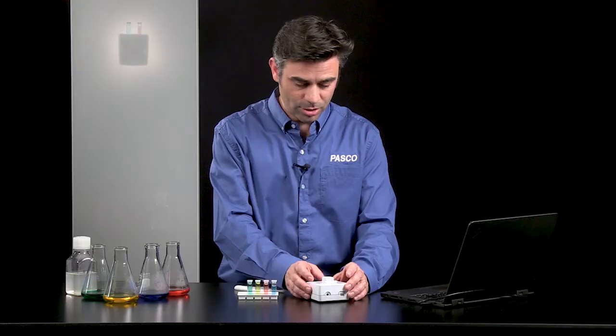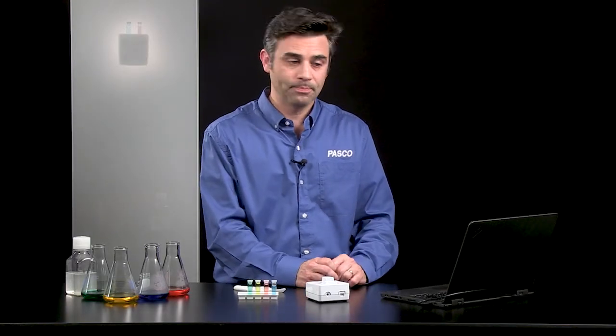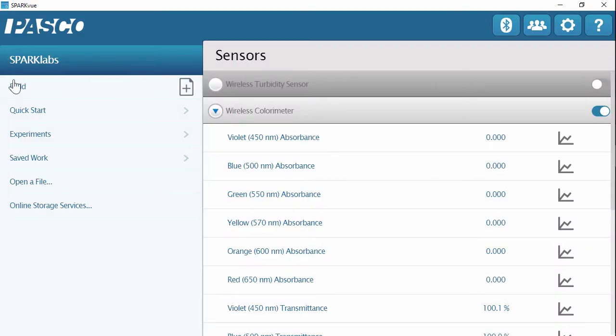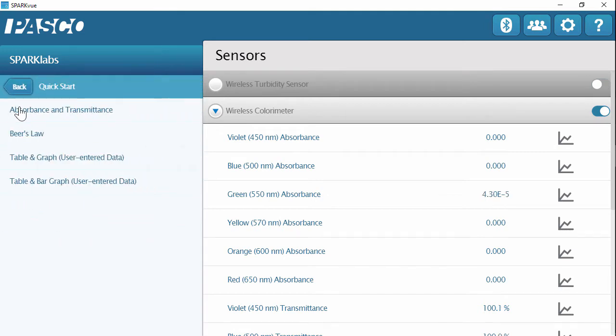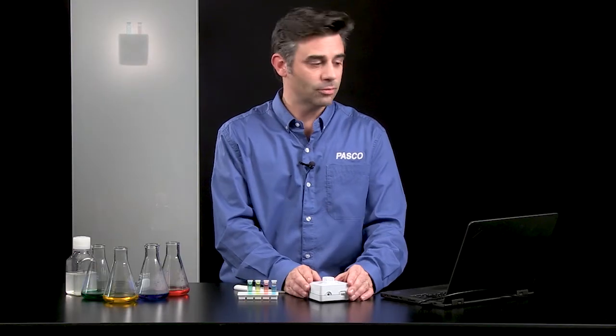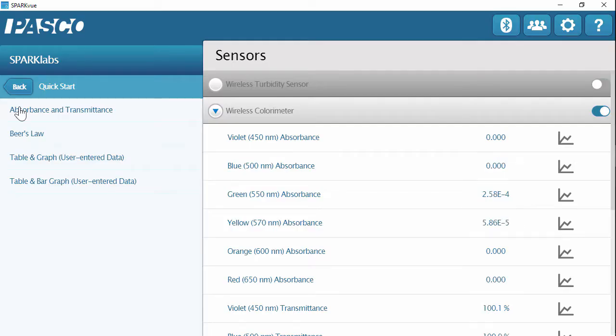Now I did want to introduce this with a quick start lab. So over here under SparkLabs, there are quick start labs that are sensor specific. So if I click on this quick start tab, then I get a couple of quick start labs that are only for this wireless colorimeter. And the first one is a great introduction, that is absorbance and transmittance.